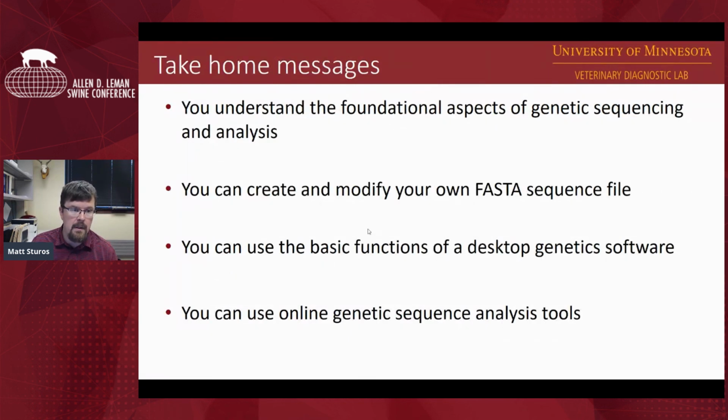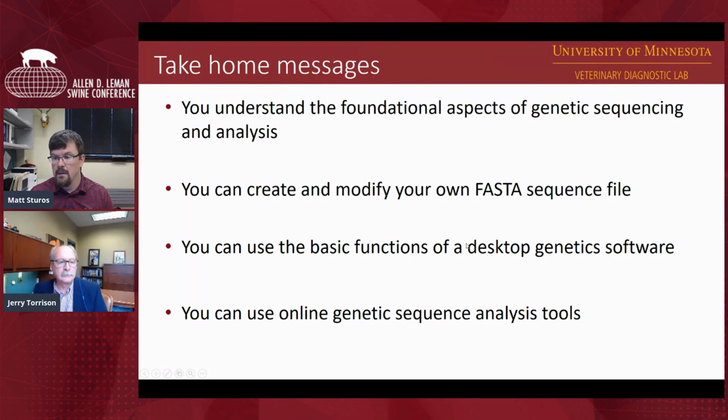So the take-home message here: I hope you understand the foundational aspects of genetic sequencing and analysis. You now can create and modify your own FASTA sequence files, and you can use the basic functions of a free-to-download desktop genetic software, and hopefully now you have some basic understanding of some of the online genetic sequence analysis tools.